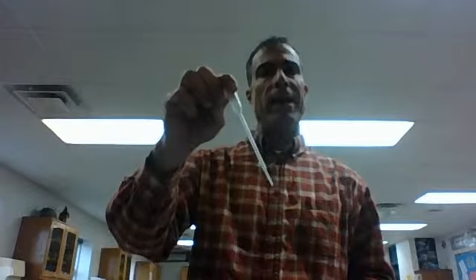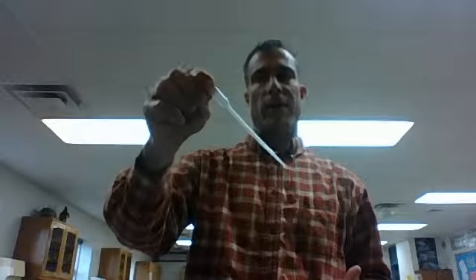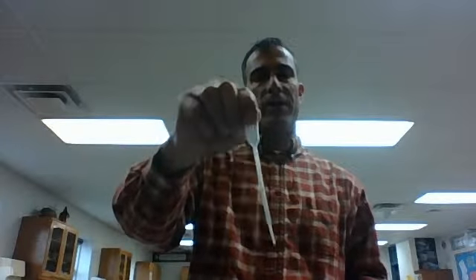The next item I have is a pipette. Some of you may call it an eyedropper. Yes, it's very similar to an eyedropper, pretty much the same thing, but we could call it a pipette in science. And you use it to get liquids. You squeeze it, sucks up the liquid, and then you can drop individual drops of liquid into a beaker or test tube.